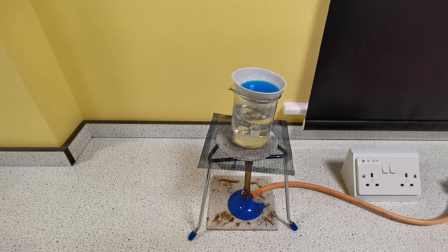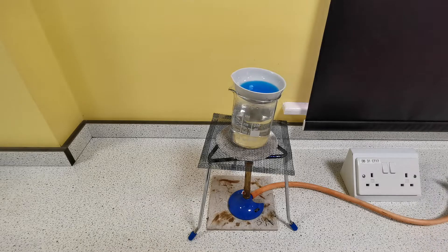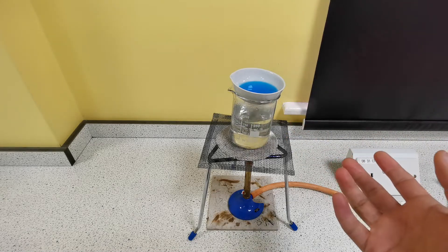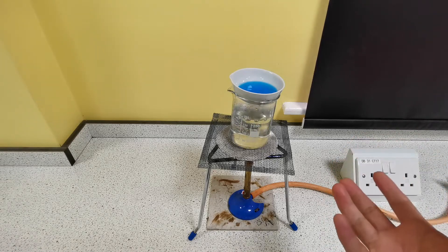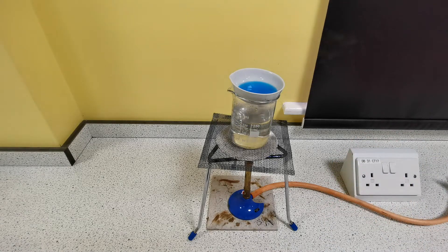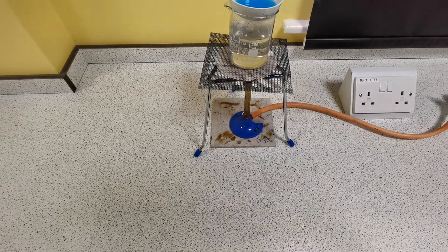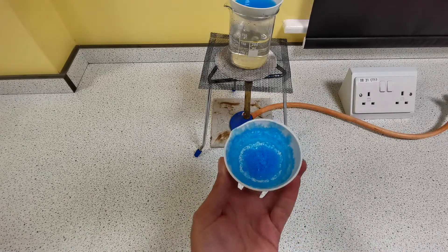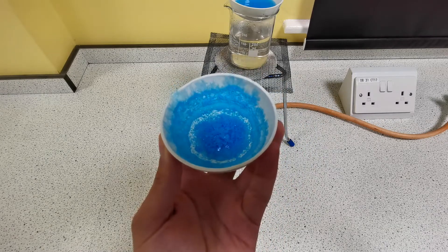When approximately half of the water has evaporated, turn the Bunsen burner off and leave it at the side of the lab for the rest of the water to evaporate at room temperature. Because it evaporates slowly, this will form large crystals. At the end, when all of the water has evaporated, you will be left with something that looks like this — pure, dry crystals of copper sulfate.